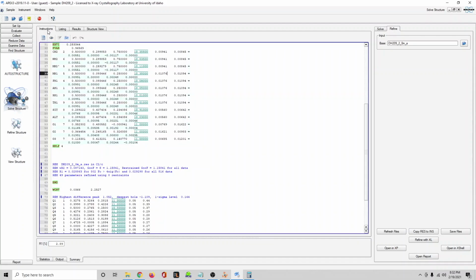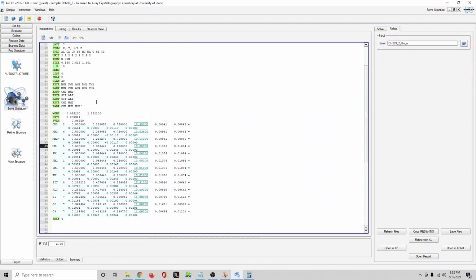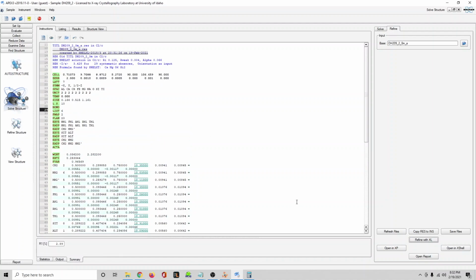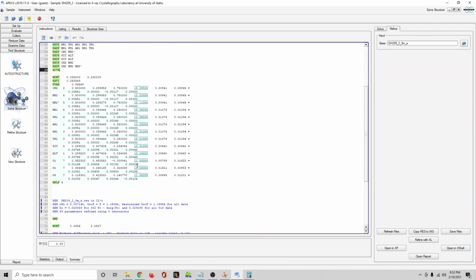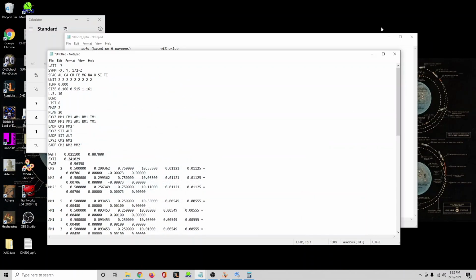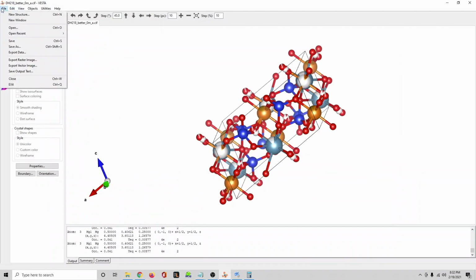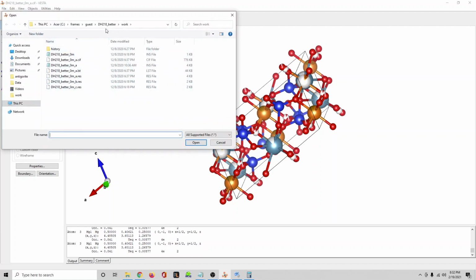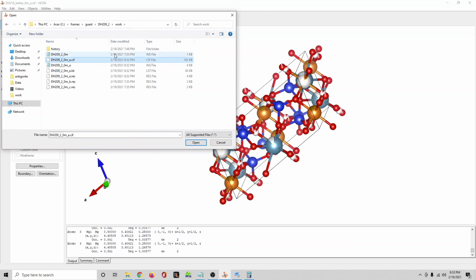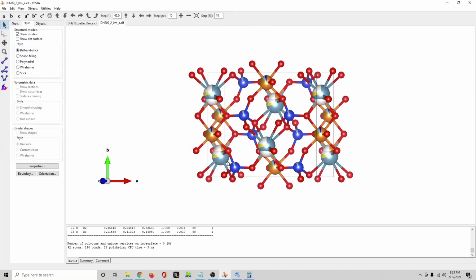And we can output this with an acta command, and all we have to do is click refine. There's probably some stuff I'm forgetting still, or other things that I could have done, but if we do that, we can open up Vesta and try to find our structure, because it just now wrote our CIF file, and there it is.